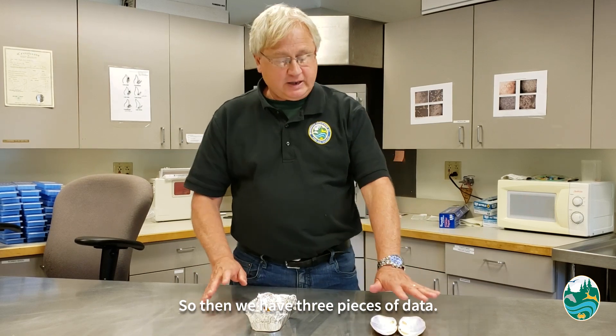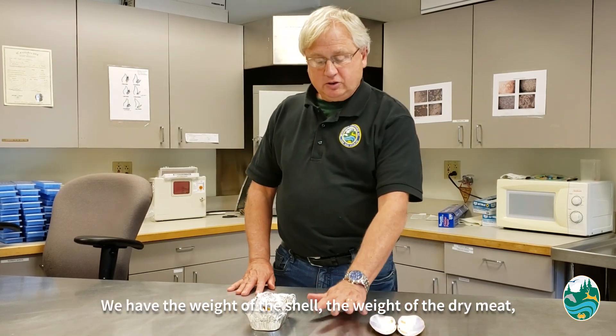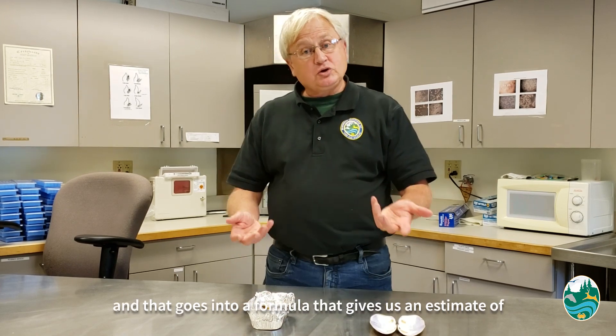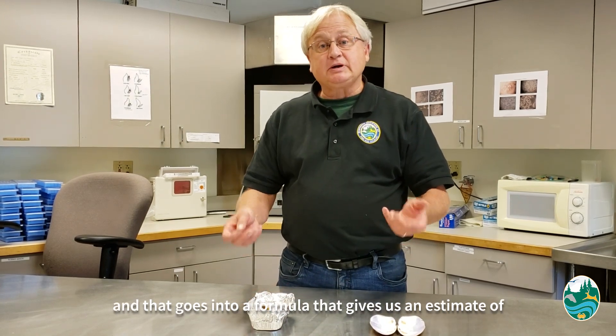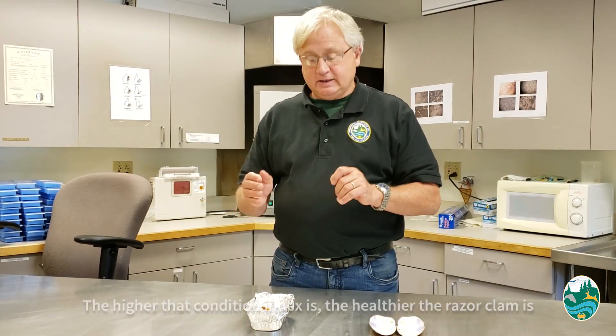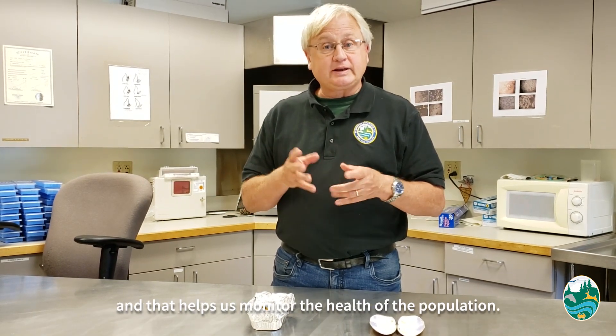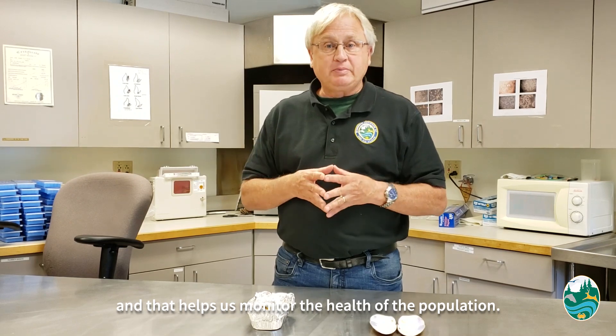So then we have three pieces of data: the weight of the shell, the weight of the wet meat, and the weight of the dried meat, and that goes into a formula that gives us an estimate of condition index. The higher that condition index is, the healthier the razor clam is, and that helps us monitor the health of the population.